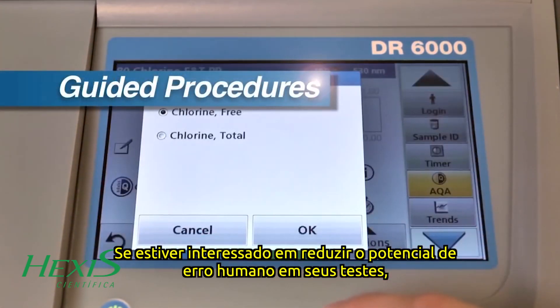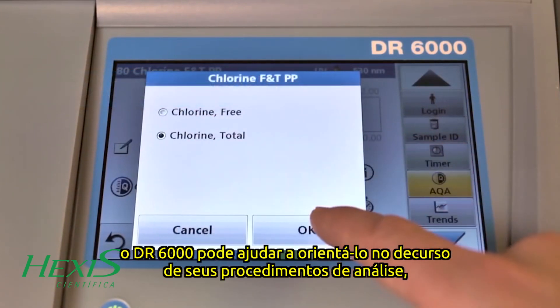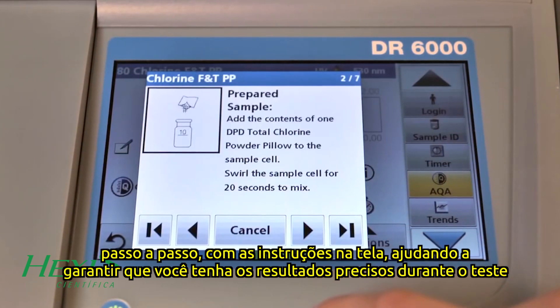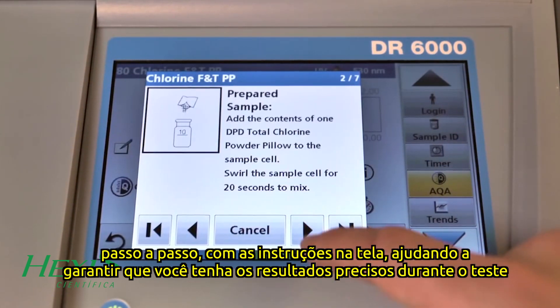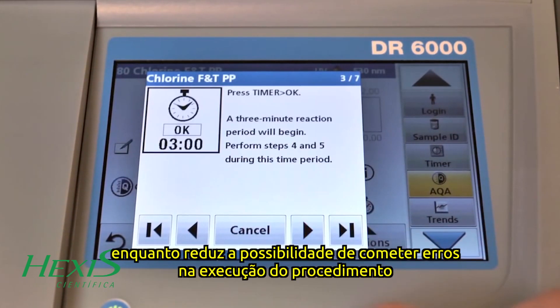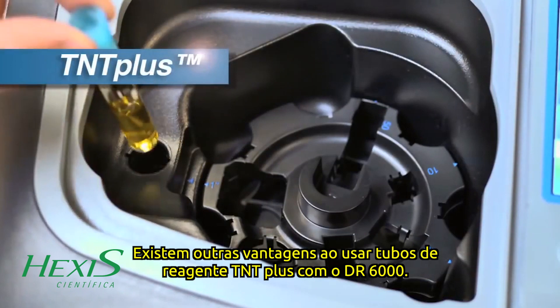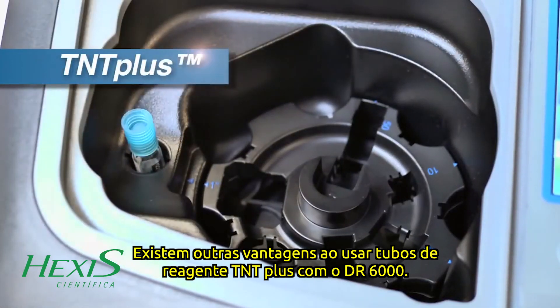If you are interested in reducing the potential for human error in your testing, the DR6000 can help guide you through your testing procedures as well. Step-by-step on-screen instructions help ensure you have accurate results during your testing by reducing the possibility of selecting the wrong program or making procedural errors.